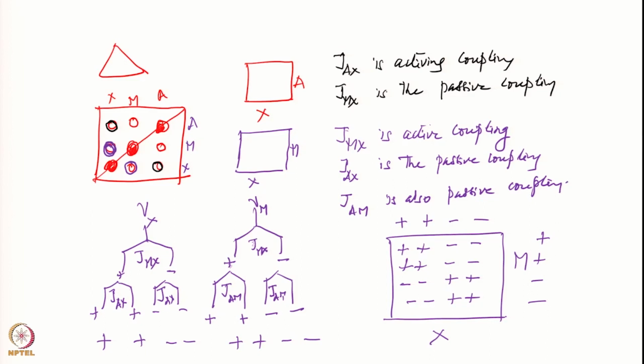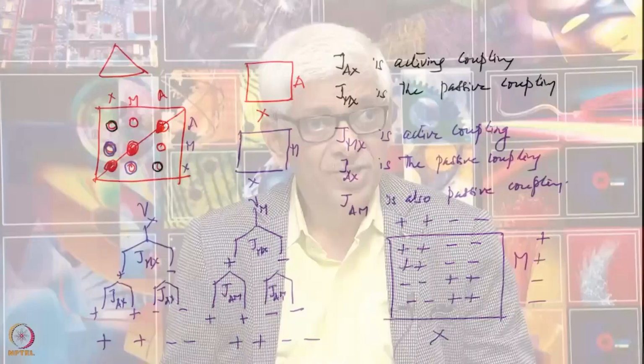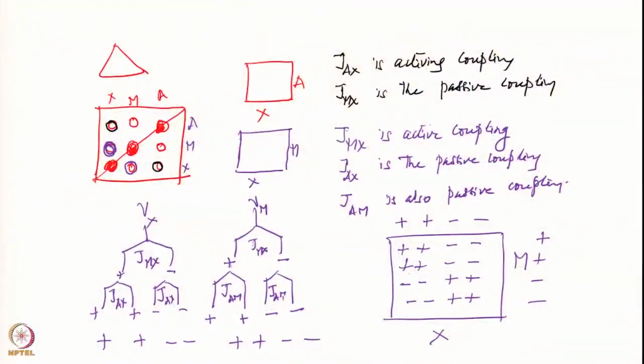Depending upon how many couplings are present in each multiplet structure, you have to multiply by that many components. So, if one side has 4 components, the other side has 2, then there will be 8 components in the cross peak. If both sides have 4, then you will have 16 components in the structure, and the locations of the pluses and the minuses will depend upon the relative magnitudes of the coupling constants.